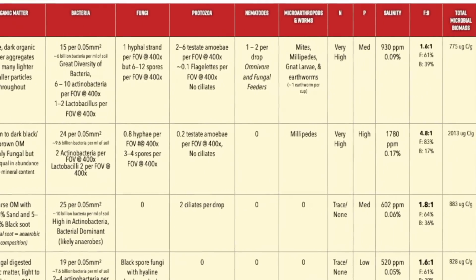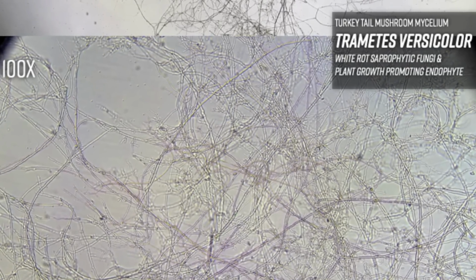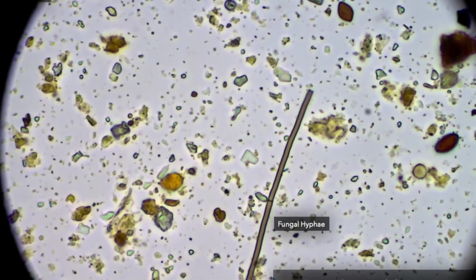We look at them all and evaluate them all together in this book. There's case studies, there's how-to, learn how to do the microscope, but also there's morphological guides, there's sizing guides. There is so much information in this book that has never been available ever in one place.